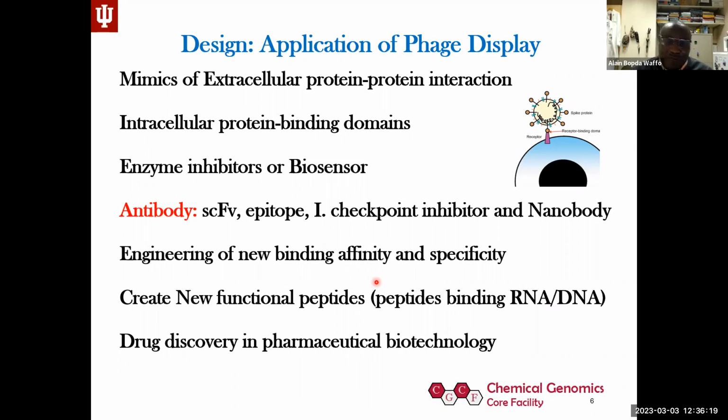We are planning with some of our colleagues to see if we can also insert non-amino acids into some of those motifs. They're very important. And something I did not mention, there are some cysteines playing a key role in nanoparticle binding.